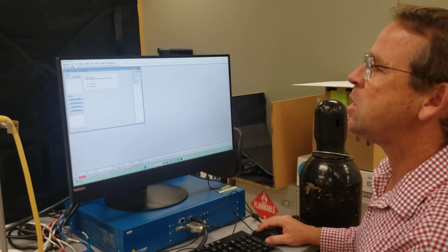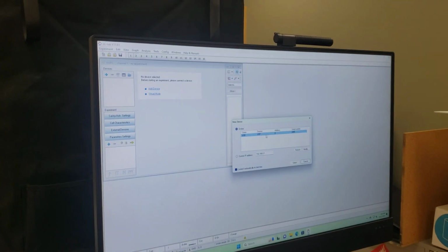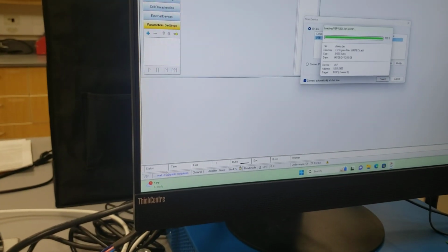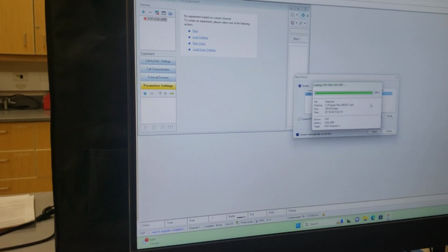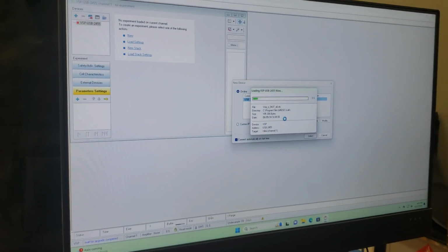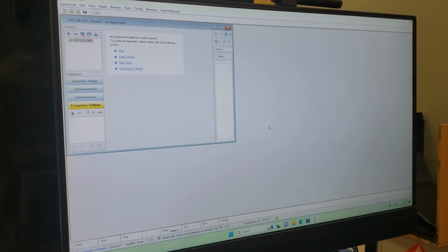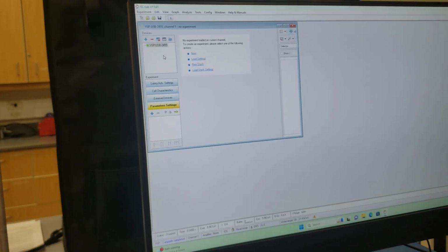After that's on, you have to go into this little thing here, add devices. We add a device like this. It's the one that should be recognized. We select it, and then it's going to do something like this, and we should be connected. All right, excellent.